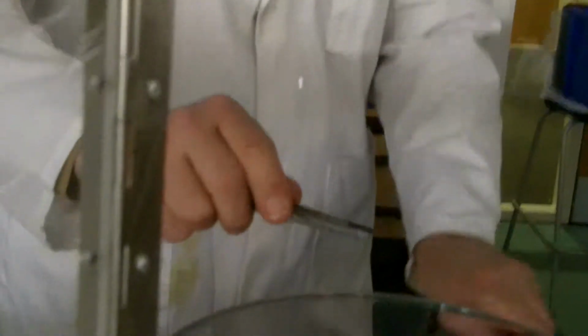Alright, I'm going to have to get you guys to stand back again. How come it's swirling into the middle? Well, it does look like it's swirling. I don't know why. It's very pretty though. Alright, here we go. Just potassium in water. And it's stuck. Whoa. Alright, so a lot more reactive.